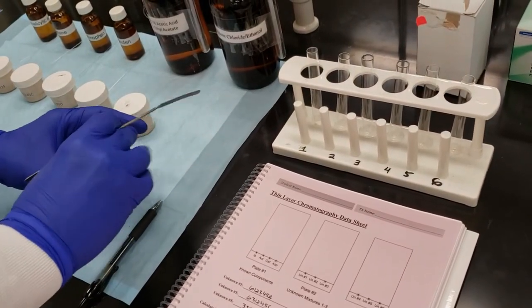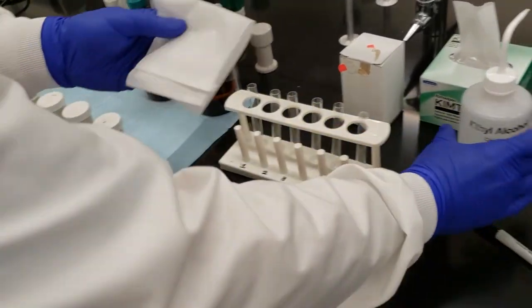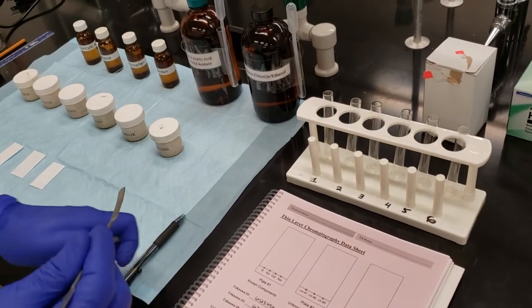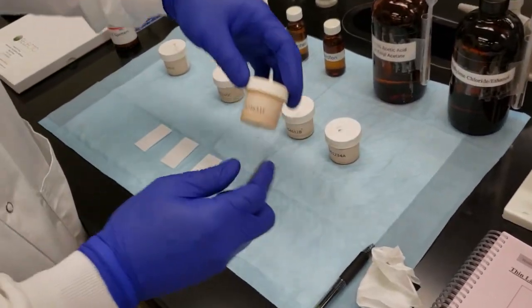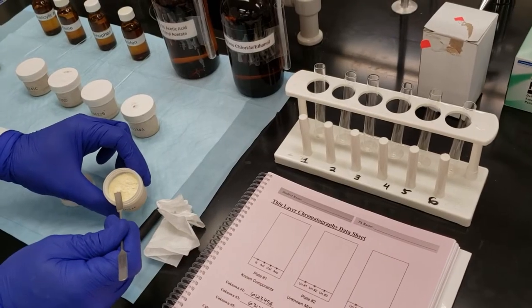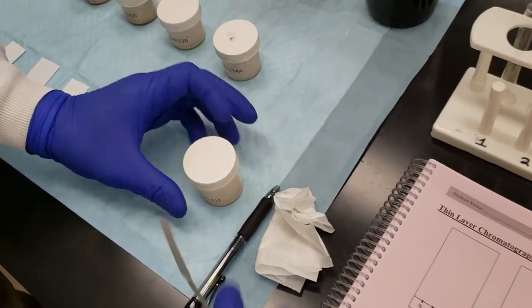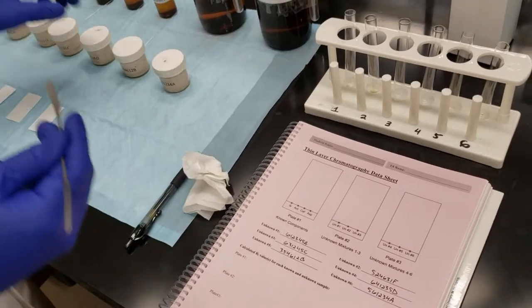Now, in between, as we're getting the powders set, we have to make sure to clean our spatula. We don't want any of these powders to mix. That can cause serious problems with the reliability of our TLC plates or our TLC spotting solutions. So I'm wiping this off with a chem wipe and ethanol. Now let's go to unknown number 2. Checking to make sure that it matches with my data sheet. Again, the tip of a spatula into test tube number 2. Cleaning the spatula again.